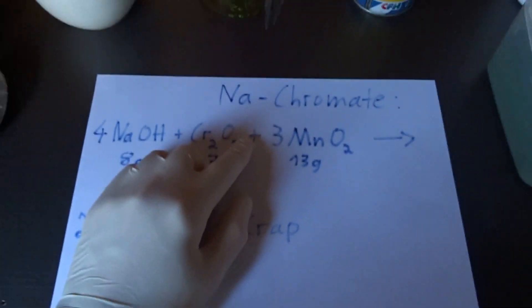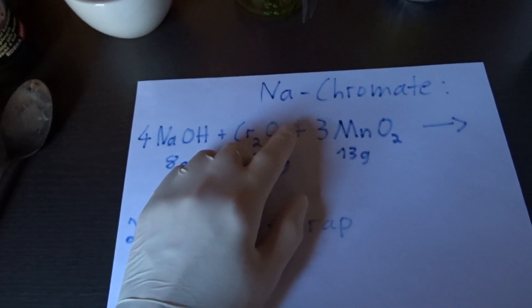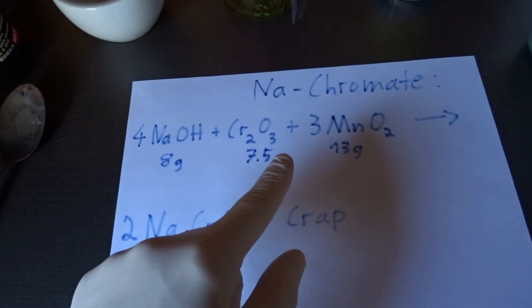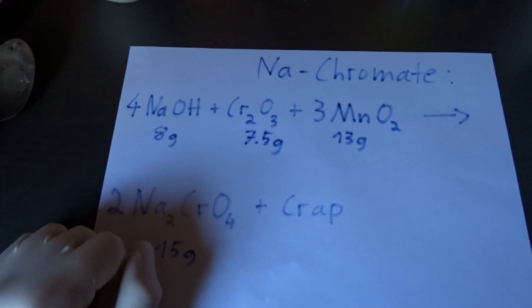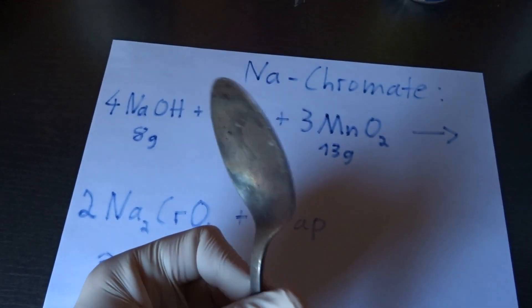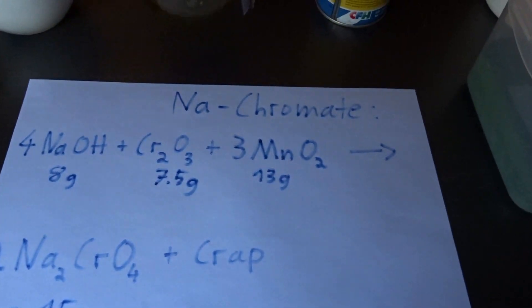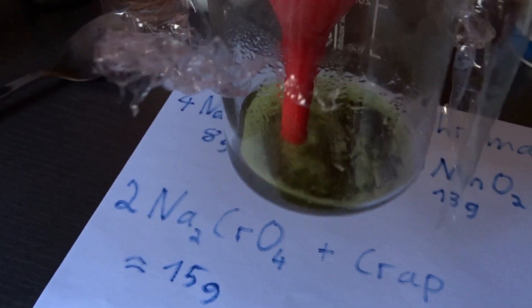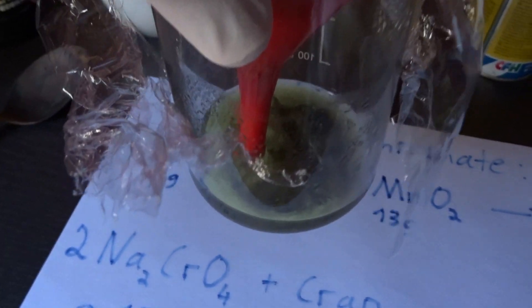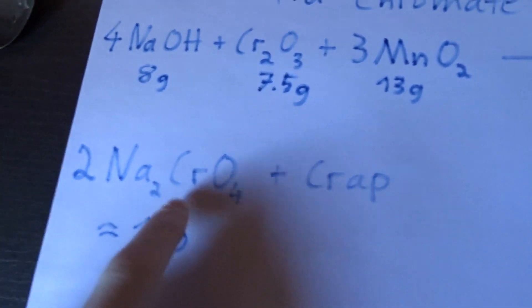Sodium chromate is quite important and the main thing is to make the synthesis amateur friendly. So there is another synthesis that's also amateur friendly and that is dissolving stainless steel like this guy here. And then oxidizing the chromium-3. I have a solution of chromium-3 in here and you see it's green with an oxidizer for example calcium hypochlorite to chromium-6 which is then obviously a chromate.